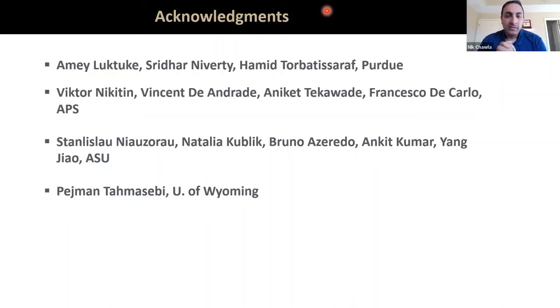So a lot of these phenomena that we're looking at are what I call truly dynamic events, things that happen in many cases in less than a second, maybe a few tens of seconds. At the lab scale, we are constrained by the acquisition time it takes to collect these data sets, primarily because we're using much lower fluxes and a polychromatic beam. So it's not unusual to have scans that are hours on end. You can do things that are interrupted in nature, but we're really running up against the time constraints.